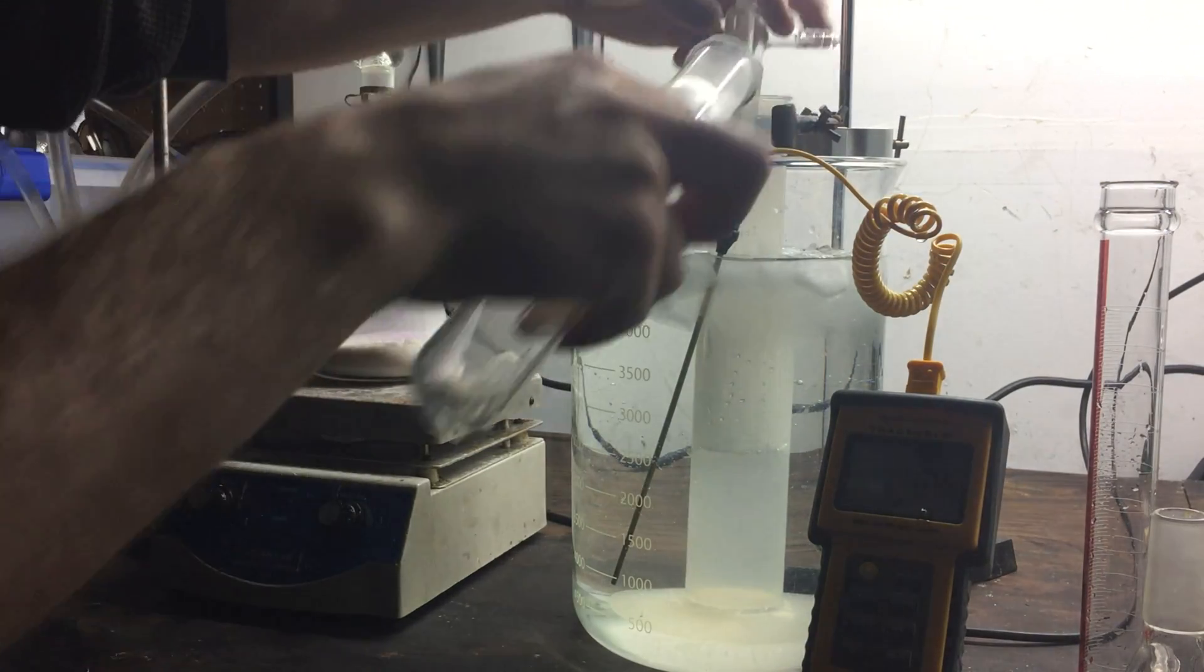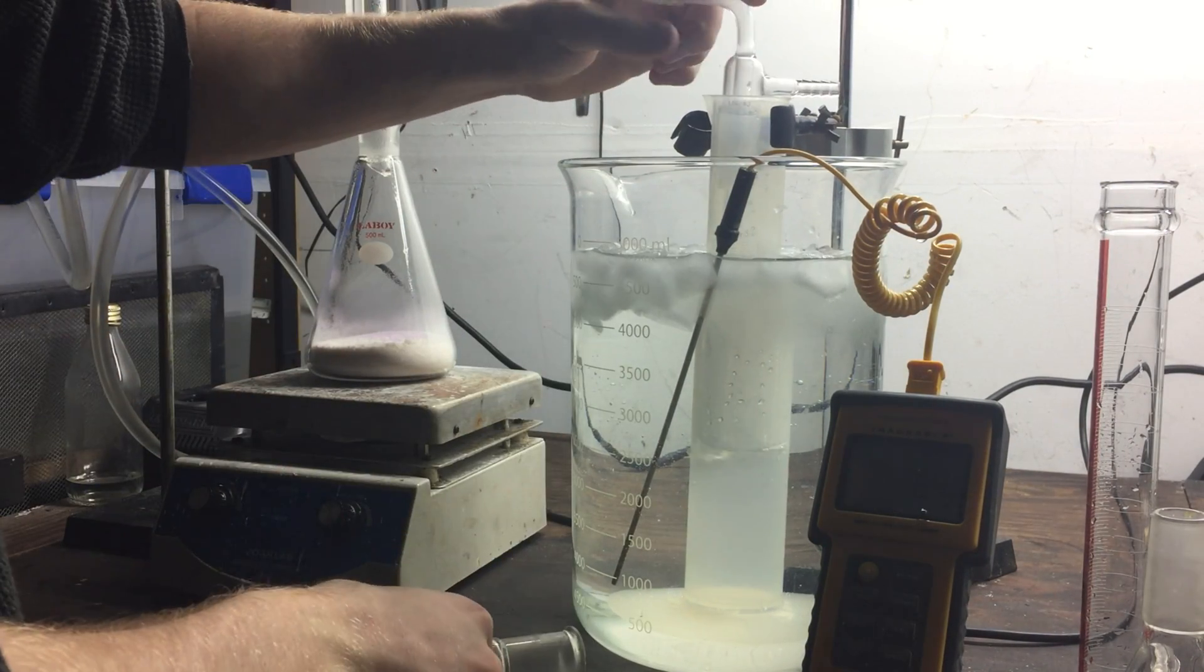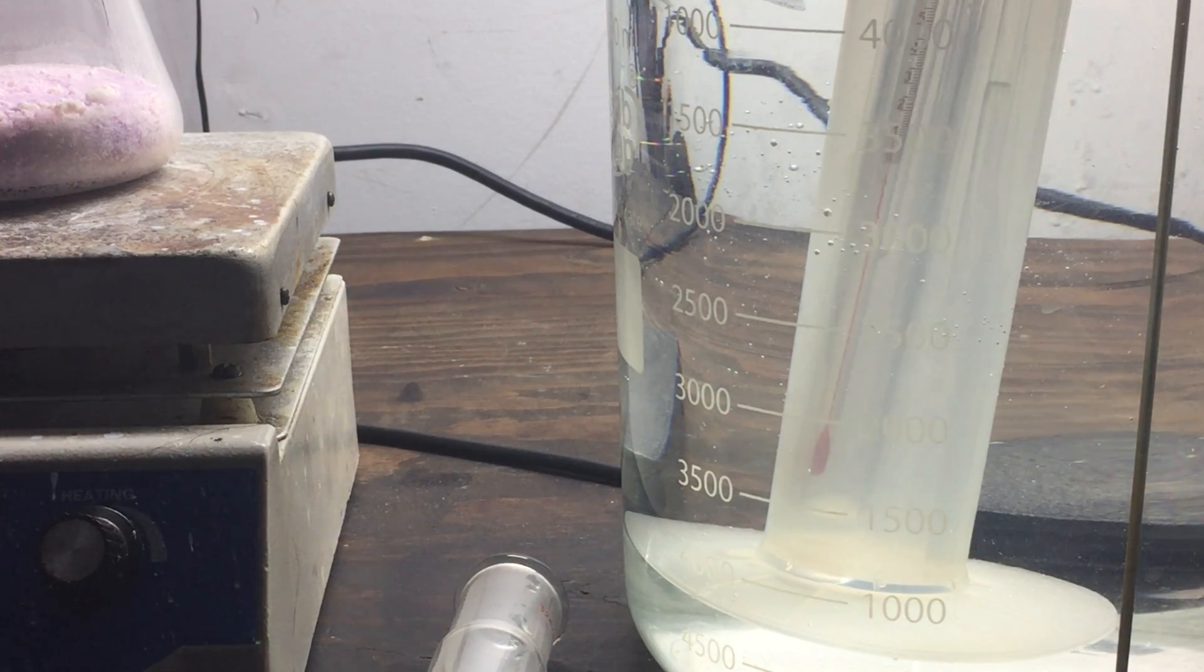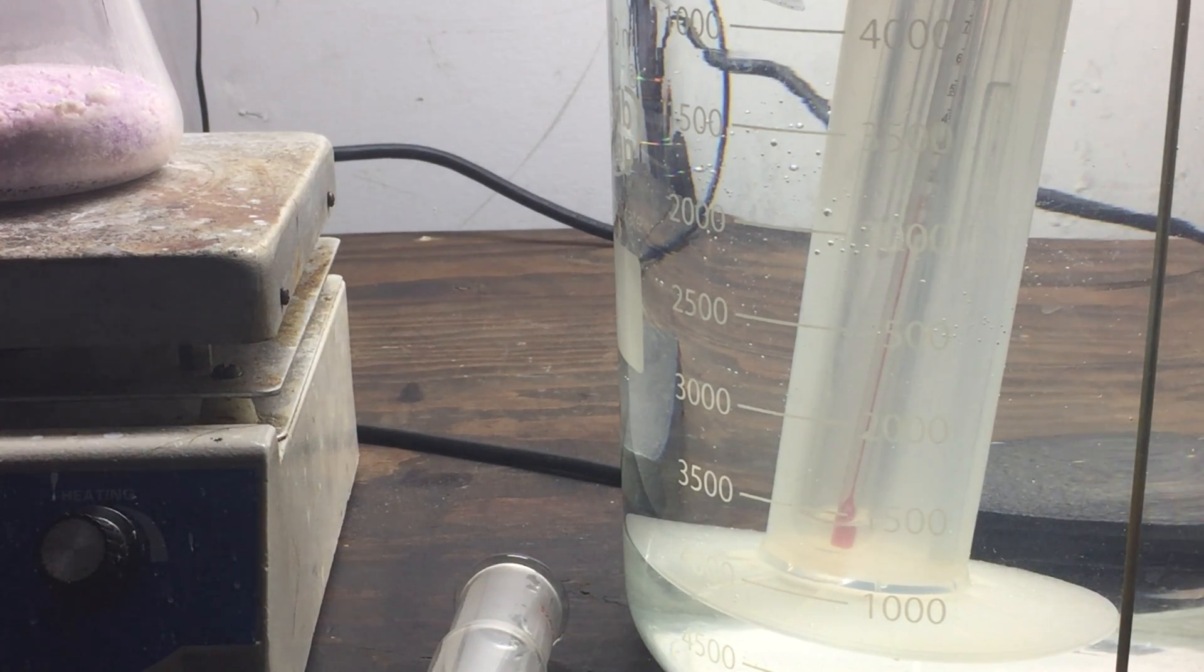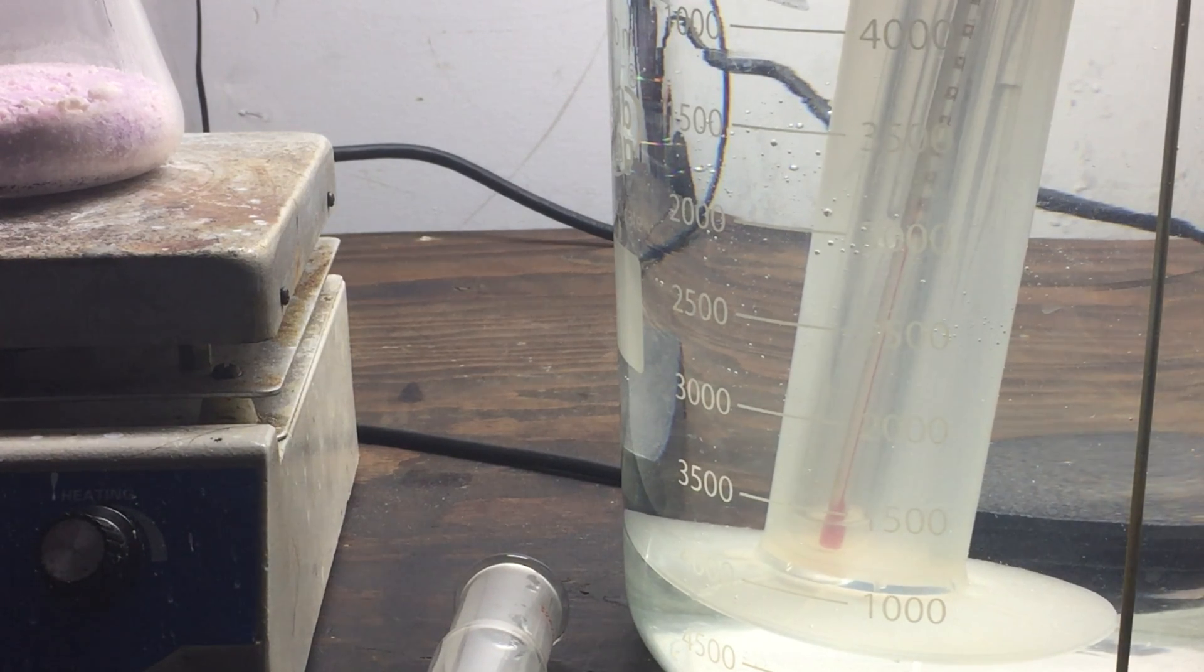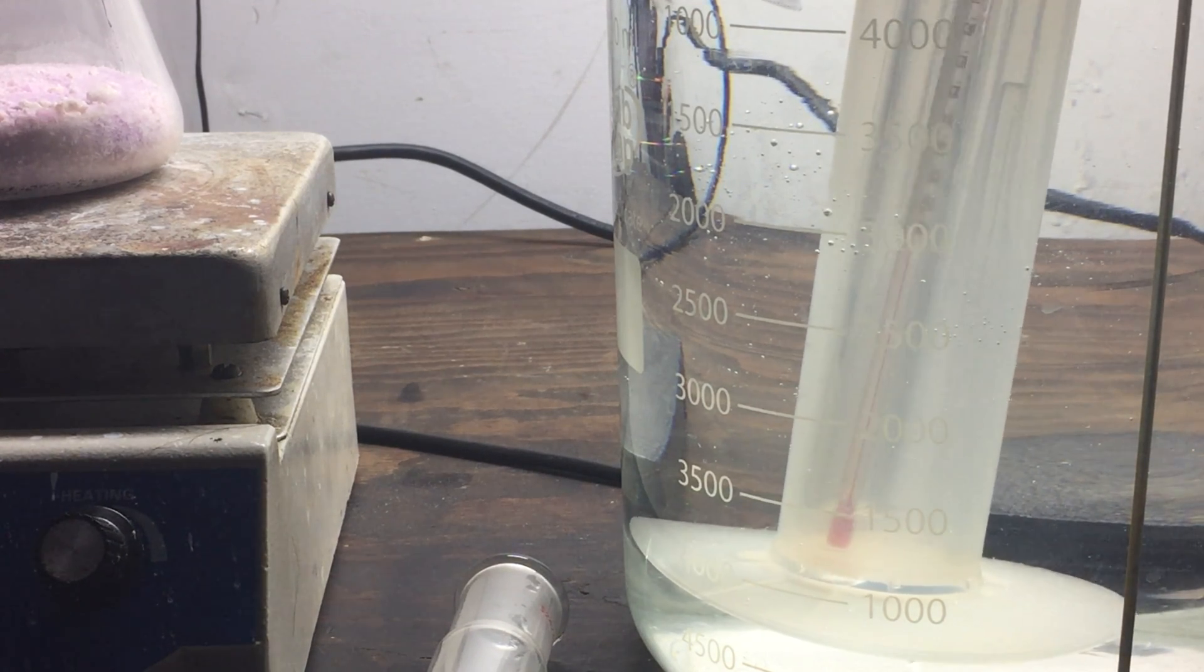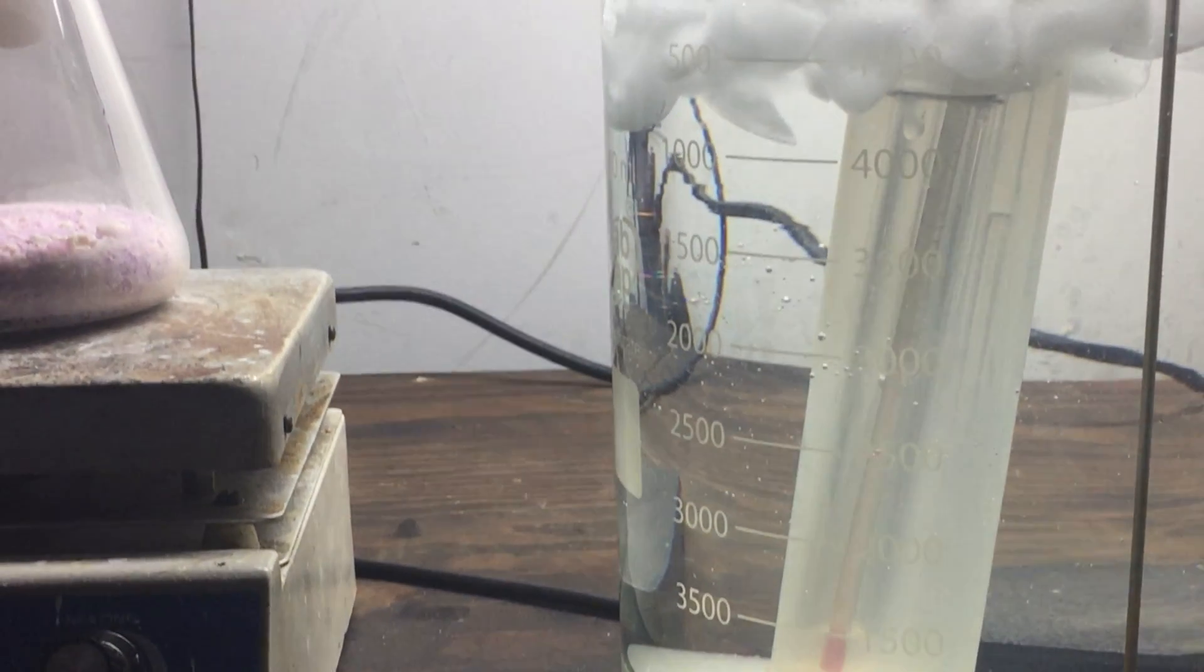To remedy this, I used a large graduated cylinder which could accommodate the increased volume. I also added some stir rods and a test tube to the graduated cylinder to displace the water so that the gas tube could sit more deeply in the solution.